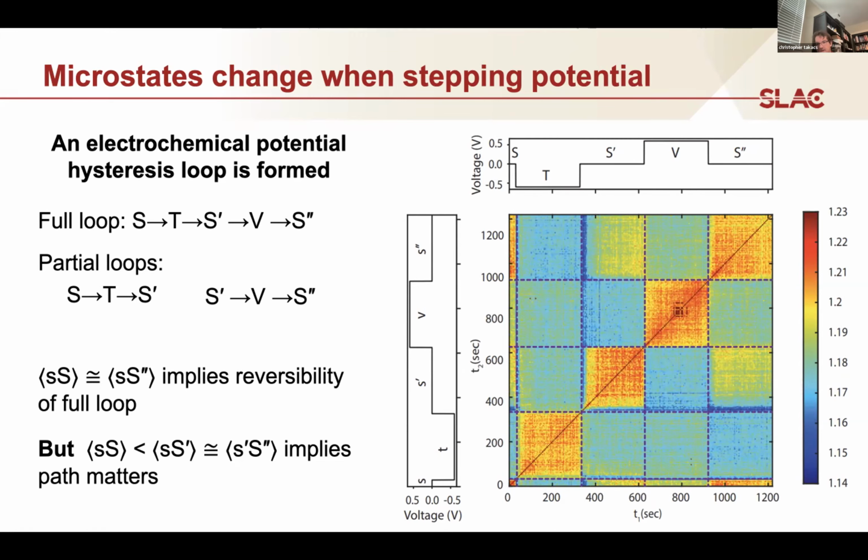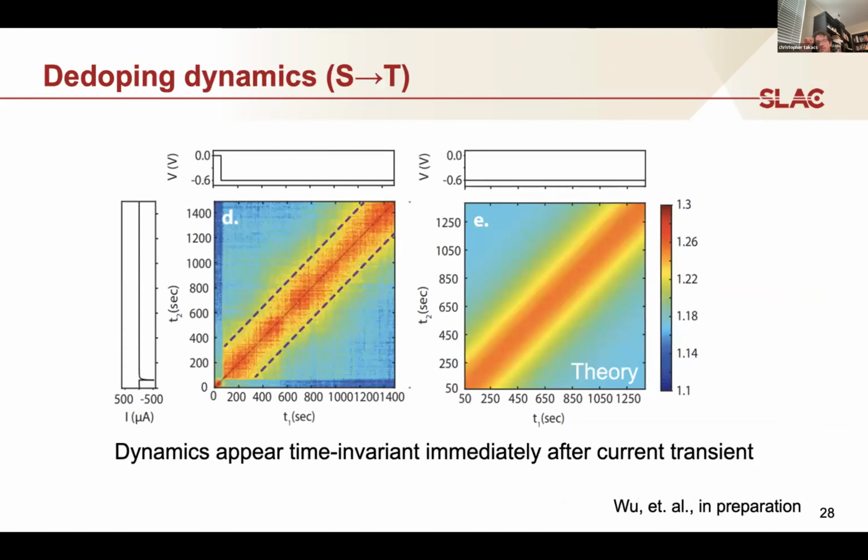So all of this was done with sodium chloride. If we instead do something with rubidium bromide, and we do a very specific experiment where we start looking at the dynamics, particularly trying to understand what's happening as we switch states. Rubidium bromide gives us a significant increase in the contrast just from the atomic number. And what we're trying to understand now is what these processes are that are happening during the transient, in addition to the equilibrium dynamics and how long it takes to get there.